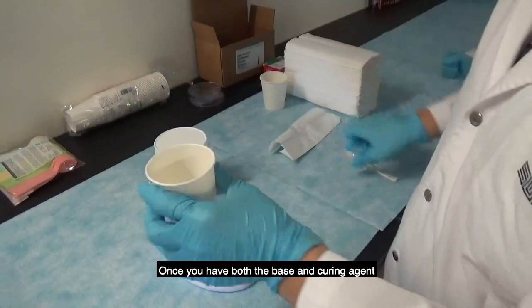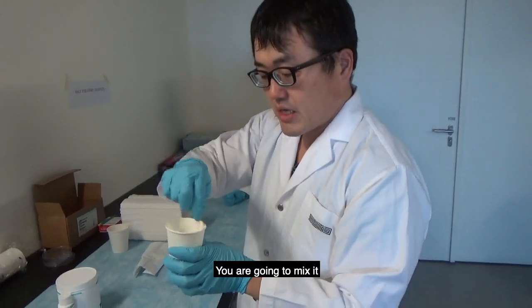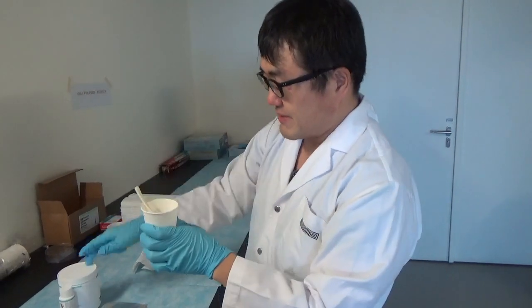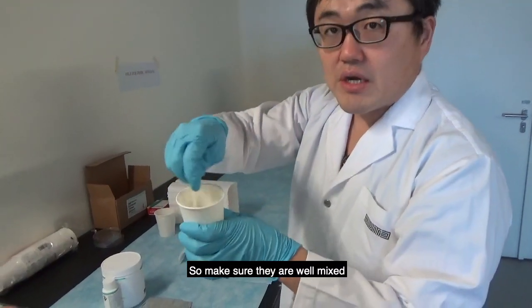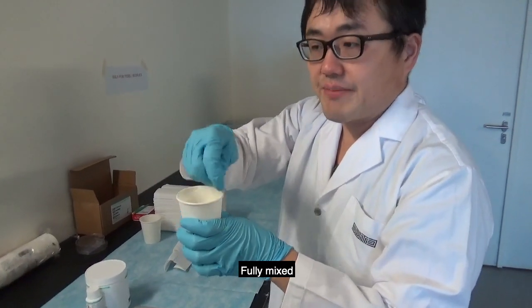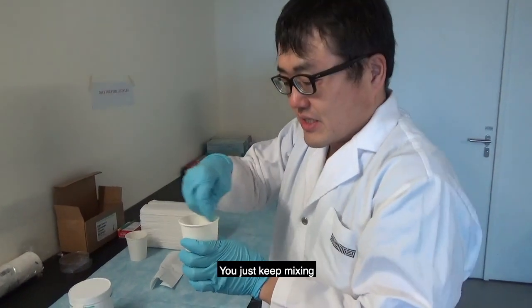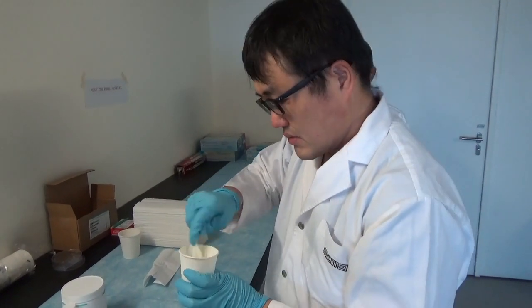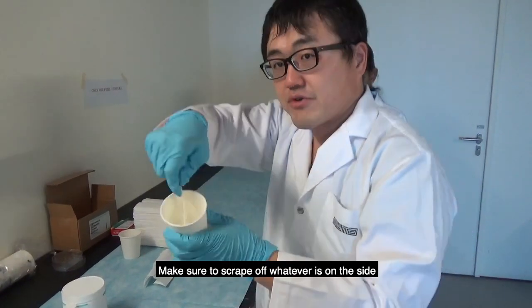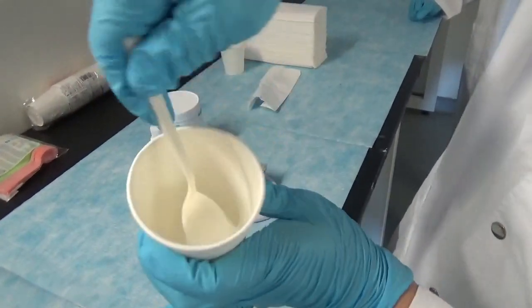Once you have both base and curing agent, you're going to mix them together. Make sure to mix really well — this is very viscous, as you can see. Mix for about one minute, and make sure to scrape off whatever is on the sides and mix it all together.